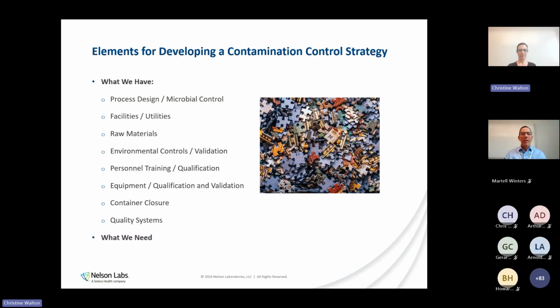So let's look now into, like Christine mentioned, just a little bit on the contamination control strategy, or CCS. Again, just to reiterate, our focus is not on whether my product is a drug or device, but on what I am trying to accomplish and what I have around me that I can implement to help with that.